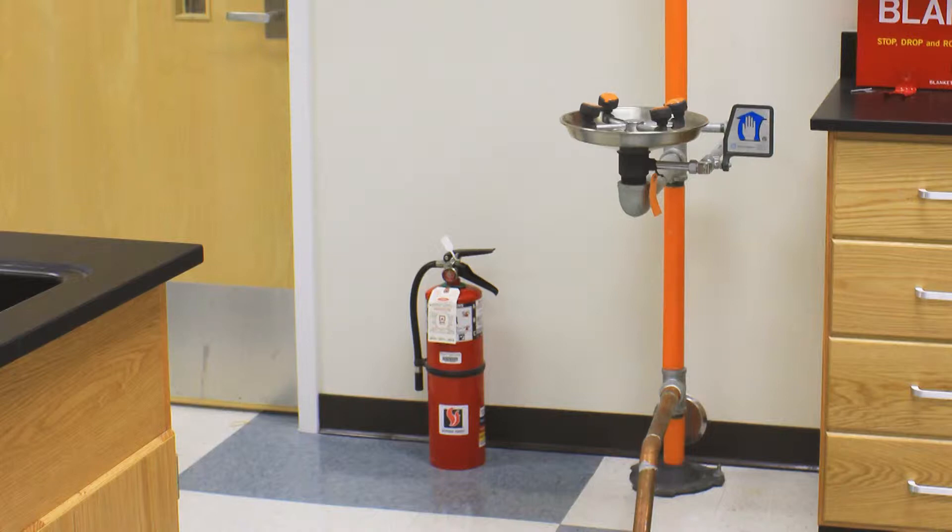In the event of a fire, you should first pull the fire alarm and notify your instructor. If the fire extinguisher is appropriate for use on the fire and you are unsure how to properly use it, please allow your instructor or someone with training to operate the fire extinguisher. A fire extinguisher should not be used to put out a fire on a person or a person's clothing because it can cause suffocation.